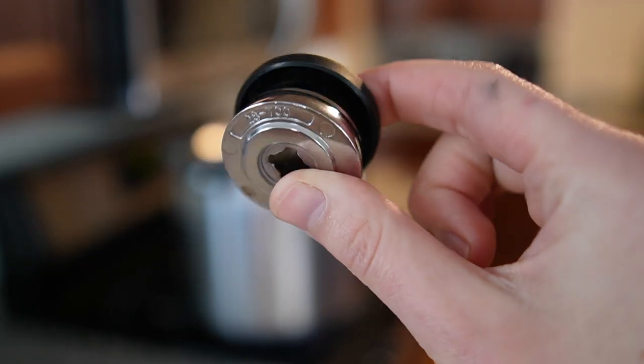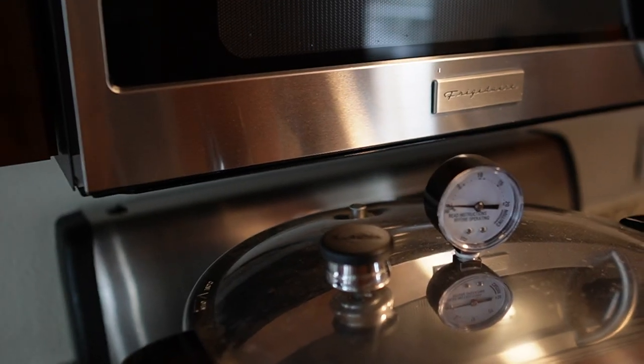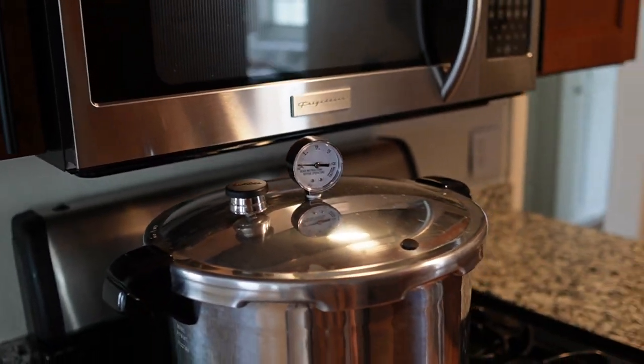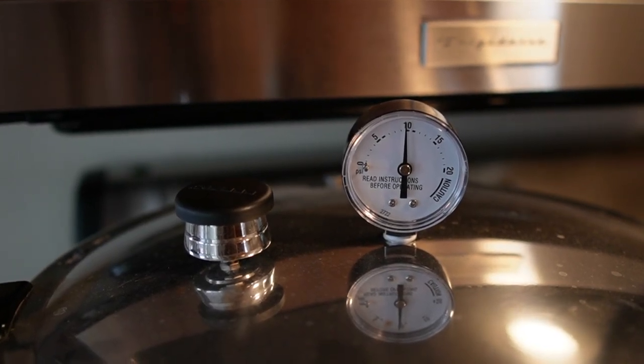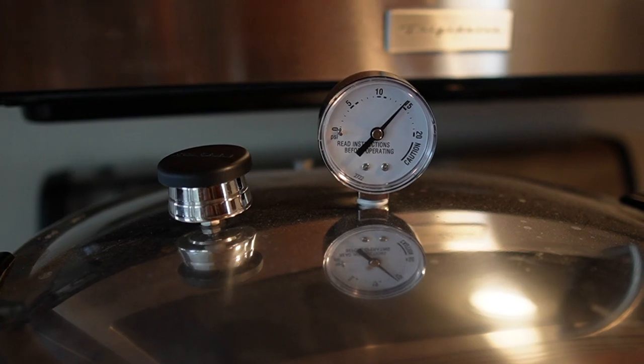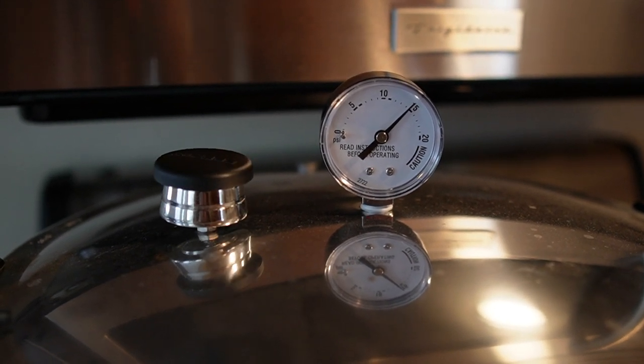After the 10 minutes of releasing steam is up, place the pressure regulator — also sometimes called a rocker — on top of the vent pipe. At this point the pressure should start to rise as reflected by the pressure gauge. When the internal pressure reaches 15 psi, the pressure regulator will begin to rock back and forth and make a very distinct sound.